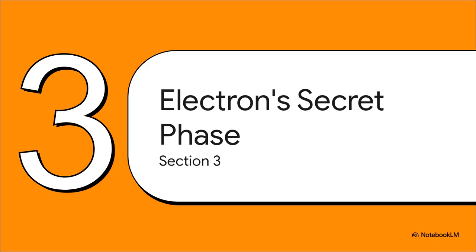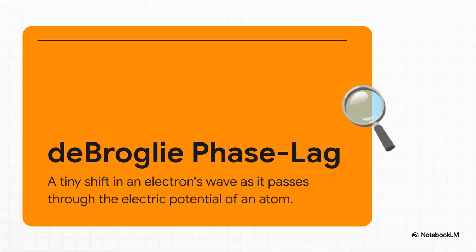Okay, so you're probably wondering, how on earth is this possible in a simple web browser? The secret isn't just clever coding. It's a really beautiful piece of quantum mechanics. It all comes down to one core concept, the de Broglie phase lag.